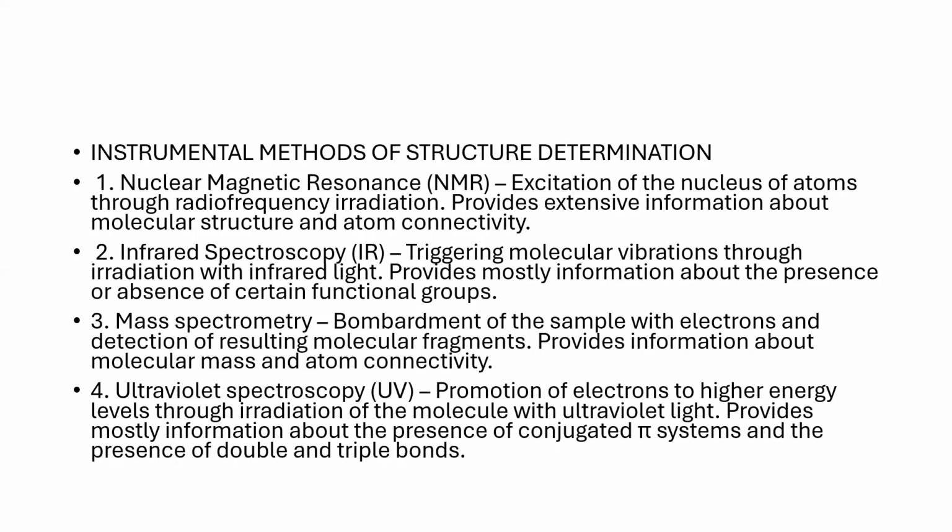The experimental method to determine the Tm value includes the use of a UV spectrophotometer, which is going to analyze the DNA at every interval and tell us how much DNA is intact and how much has melted, because as DNA melts, absorbance increases. So these are certain examples we had discussed. Protein estimation yesterday we had also discussed using UV.